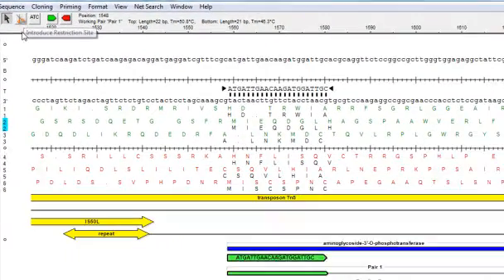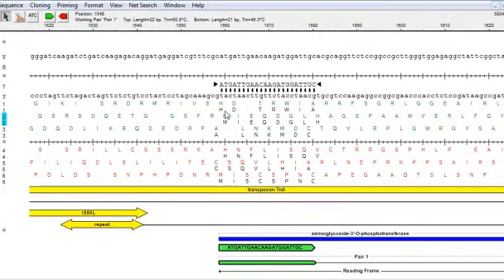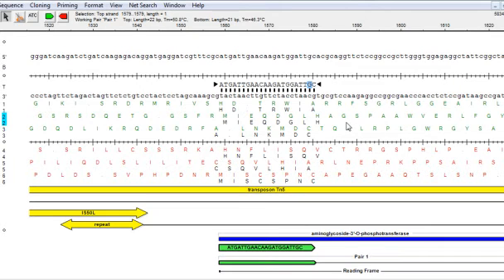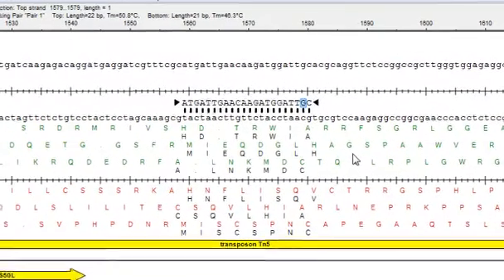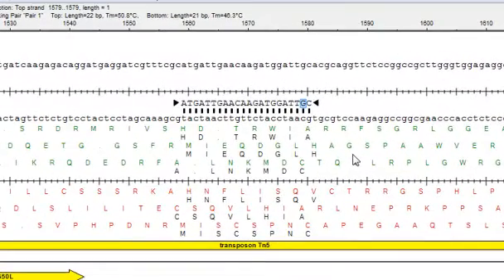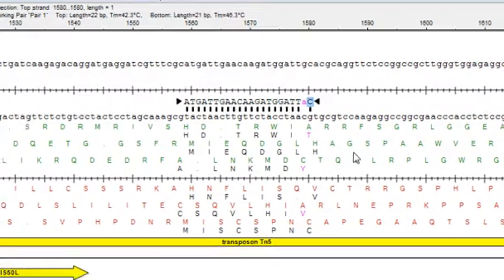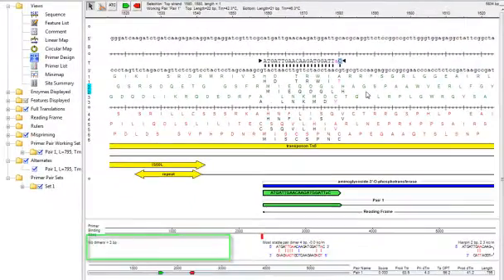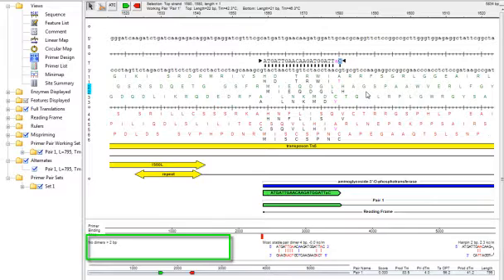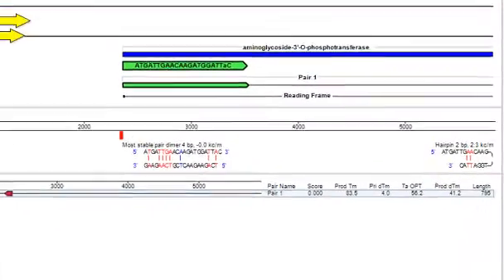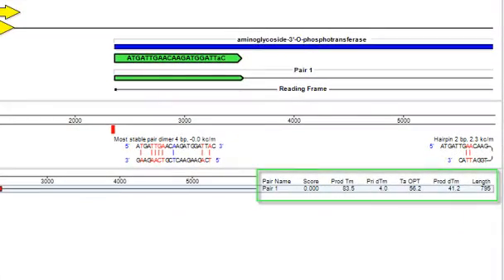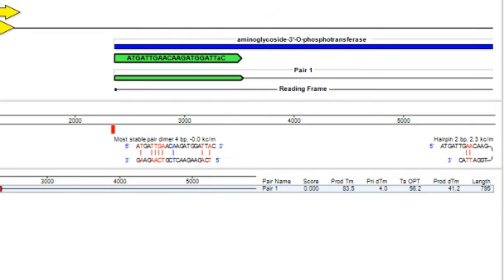You can also edit your primer sequence just by clicking on it and typing over it. And notice that any changes you make here are reflected immediately in the other panes, as well as in all of the other SeqBuilder views. So, by changing this G to an A, for example, you can see that there are no longer any stable dimers here in the middle pane. And all of the other information, such as melting temperature and product length, have been updated as well.